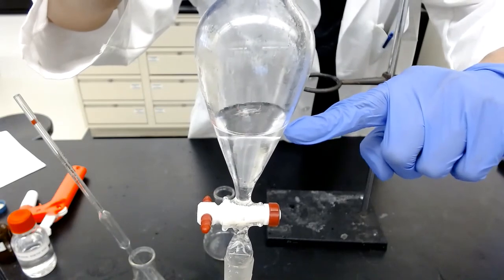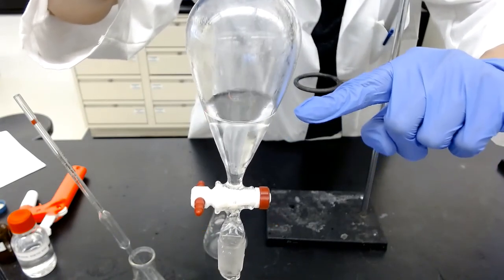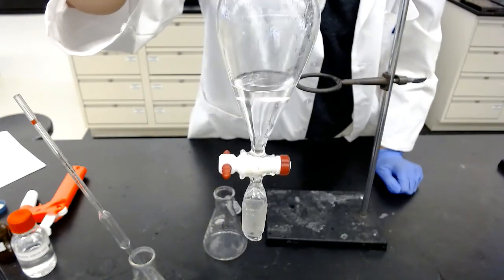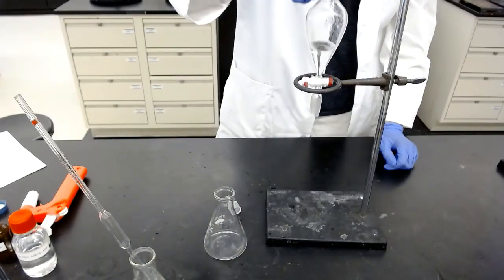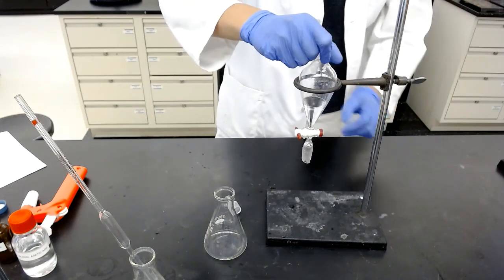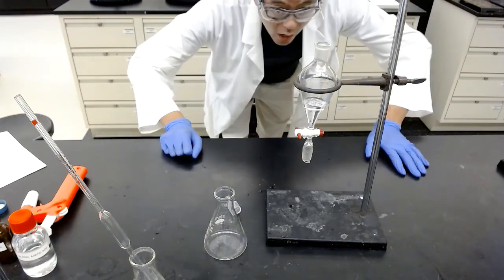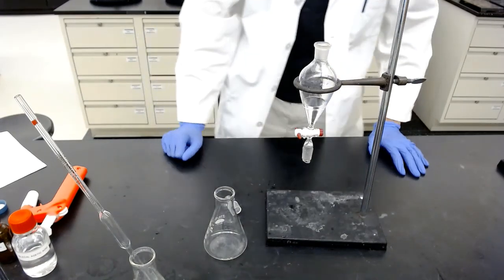The interface is right there, right? The top layer is the organic layer, the bottom layer is the aqueous layer. Why is that? The density, all right? You're supposed to look up the density of ethyl acetate, all right? If you check the number versus water, you'll know why. All right, so now it's all done.